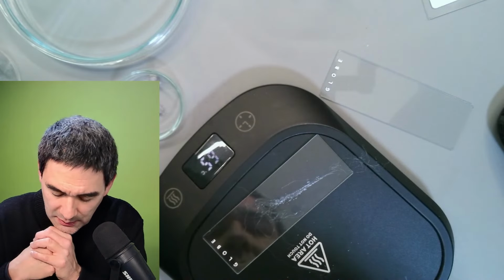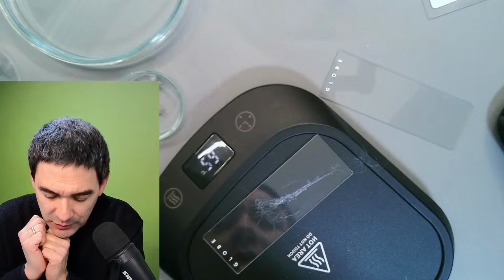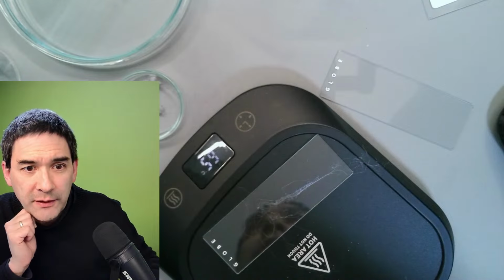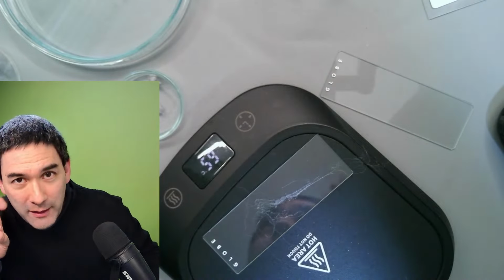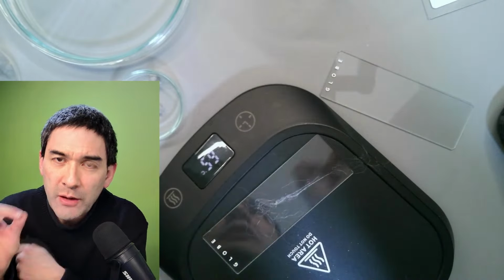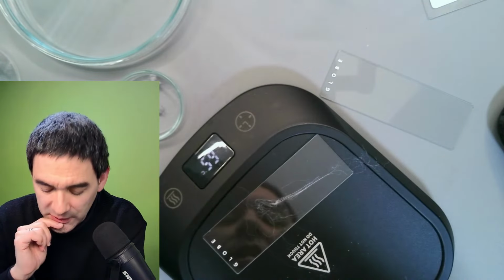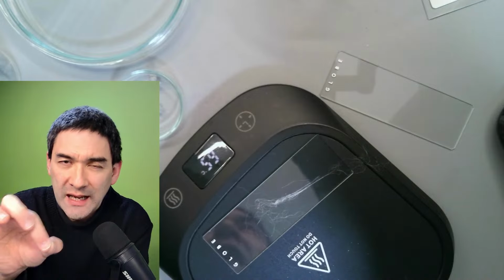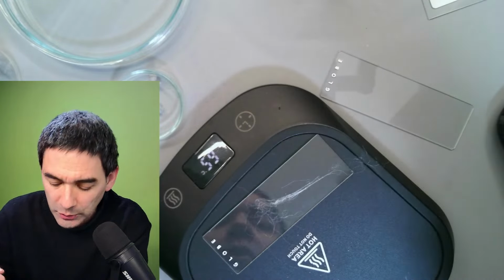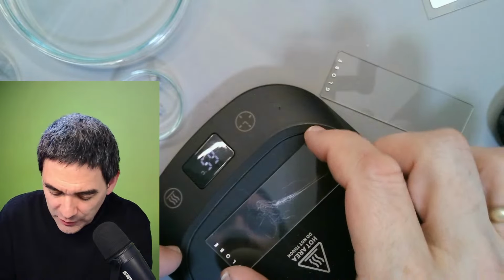Yeah. And this soldering iron technique is not something that I invented. I did a little bit of research, and some publications that I found actually said that this is an official way, official under quotation marks, of testing the material of the fibers. And you have to use a hot needle. So basically a pin or a needle. But I was saying, well, if I put a needle over a candle, by the time I've got it under the microscope, it's already cooled off. So I'm just trying to use a soldering iron.